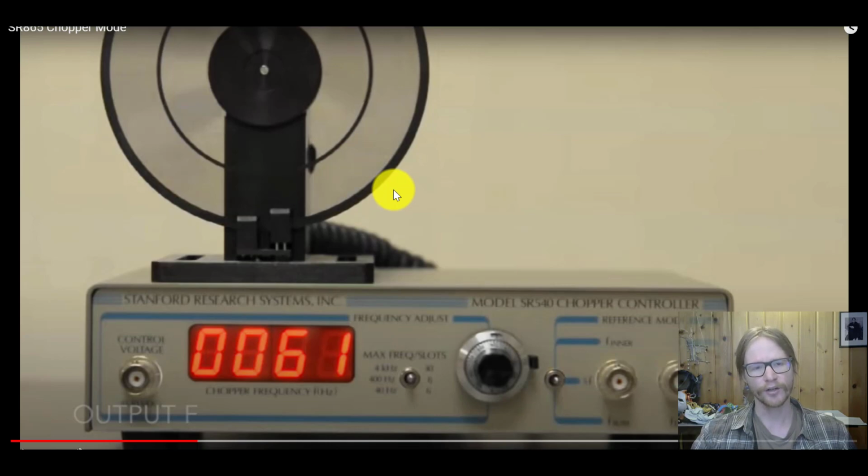I'm not going to show you the entire tutorial video because it's irrelevant to this class. But this would be how you would set up your own chopped system. And so if you go on, you do some research, and that research has to do with spectroscopy. Most often the type of spectroscopy you're doing is something you built yourself, not an off-the-shelf system.